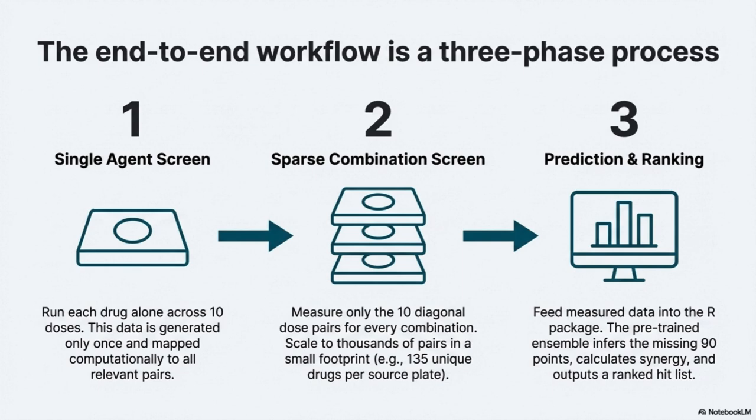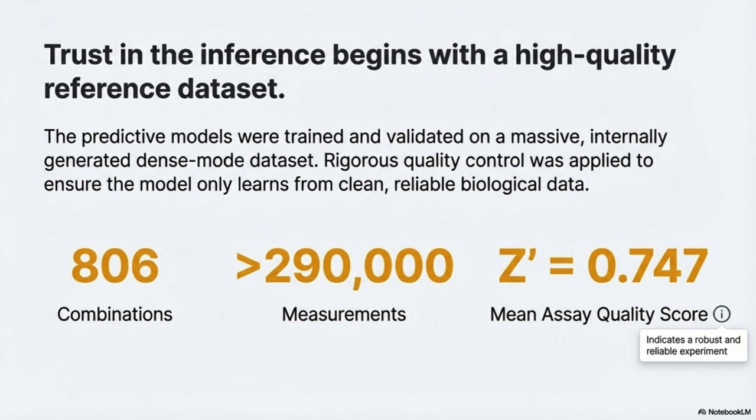But there's a practical note here. Because you're shifting from 200 down to 20 nanoliters and changing the plate, the sources do mention you can sometimes see a slight shift in the observed potency. It's a trade-off. A trade-off for that massive gain in scale. Exactly. Okay, so we have the Echo hardware running. Let's turn to the software side, the installation. This is where the computational listener starts to lean in.